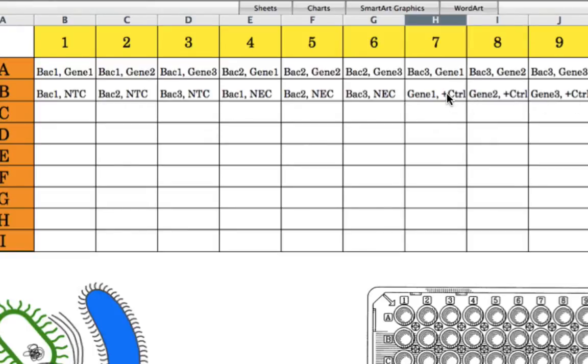And then you will have a positive control, right? So let's say you have an E. coli genome, or maybe that plasmid we talked about, which contains the flagella gene, and you have the primer pairs. Typically you don't start assembling one tube at a time. It's not that you will take magnesium chloride, then water, then nucleotide mix, upstream downstream primers, one tube at a time.